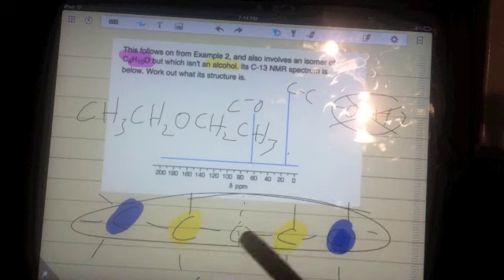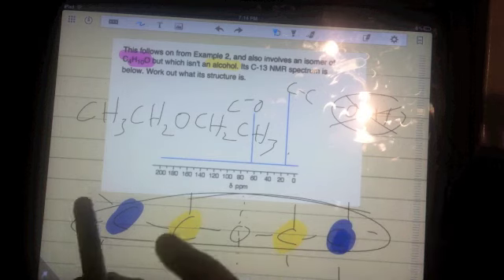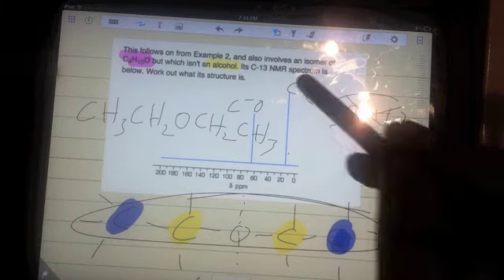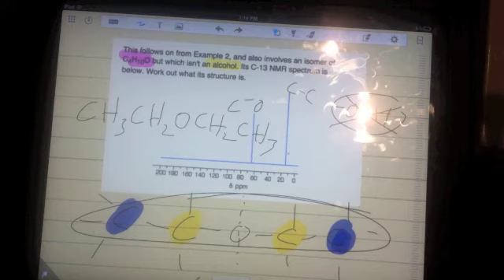Now, this is Carbon NMR, and as you can see, it's pretty straightforward. It's just putting in what you have and jigsawing it together until it makes sense. Next up is hydrogen NMR, which is a bit more detailed and you get more information out of it. And yeah, you can basically get structures a bit easier with less confusion as to what they might be with hydrogen NMR compared to carbon NMR.